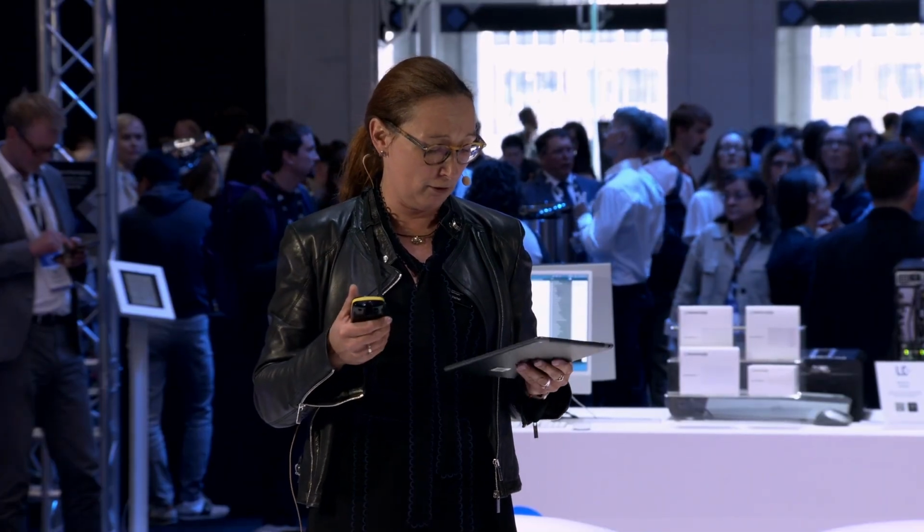The first example comes from a publication by De Boer and colleagues earlier this year. The team was looking to establish a workflow for analyzing short tandem repeats in neurological disorders. They created a panel sequencing for 9 genes associated with spinocerebellar ataxia and Fragile X syndrome.